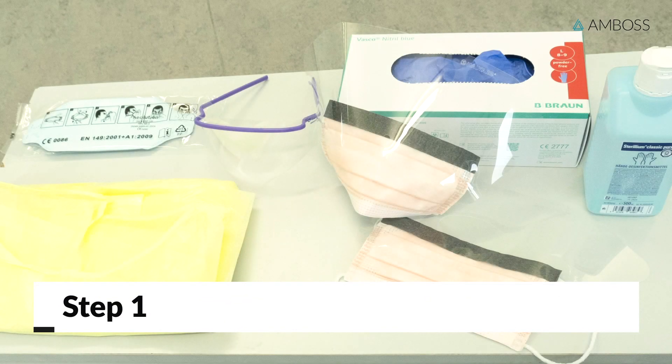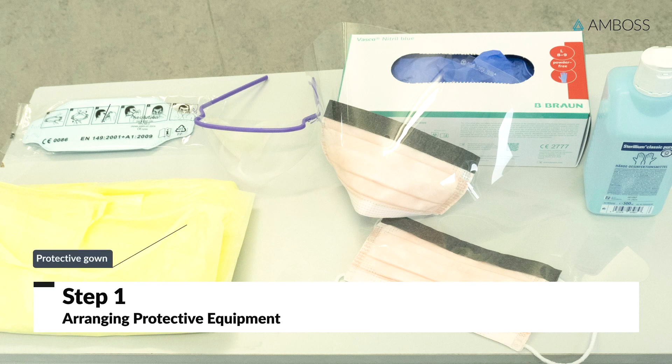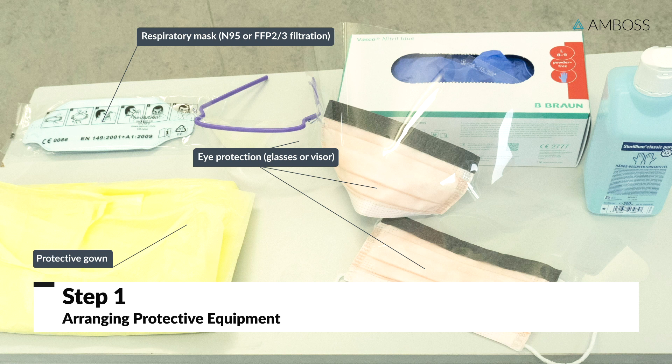First, arrange the necessary protective equipment. This includes a protective gown, respiratory mask — here we will be using a mask with N95-equivalent filtration — eye protection such as glasses or visor, properly sized disposable gloves, and sufficient disinfectant.